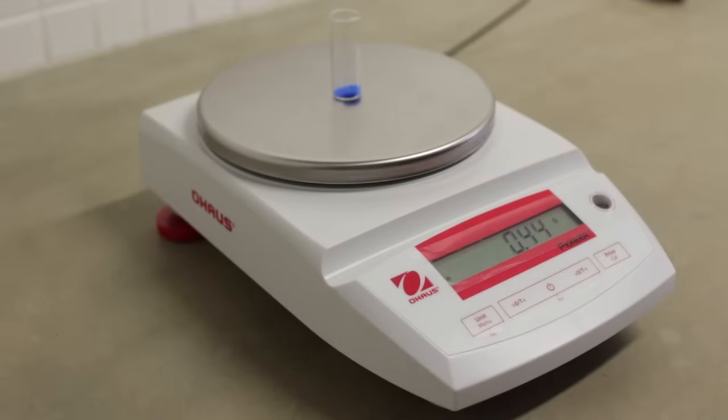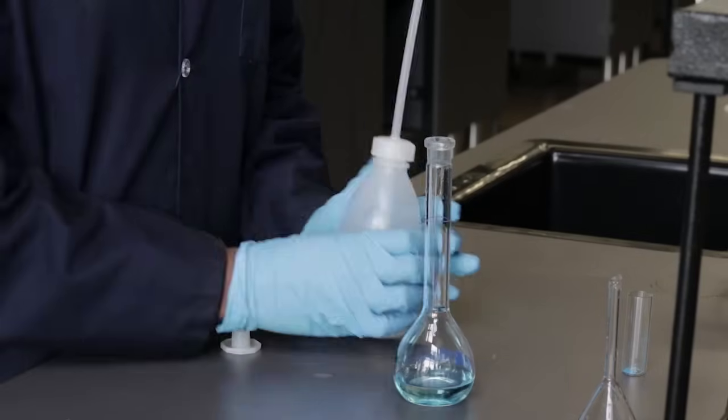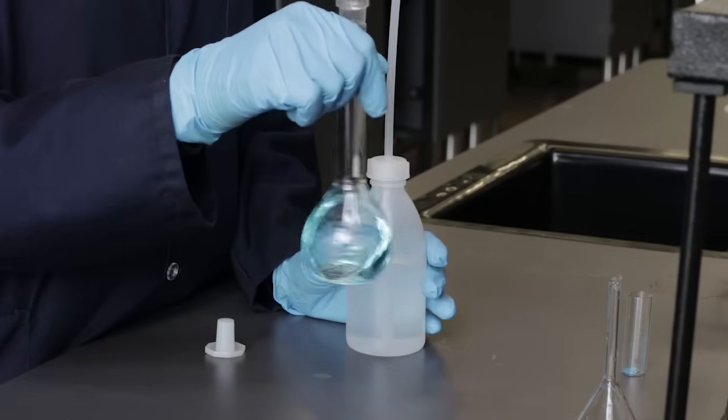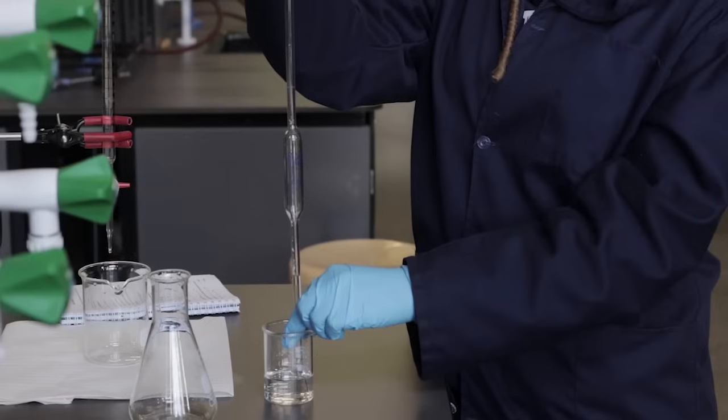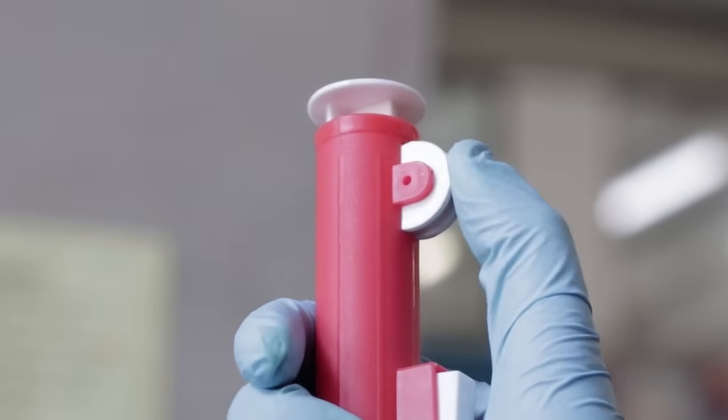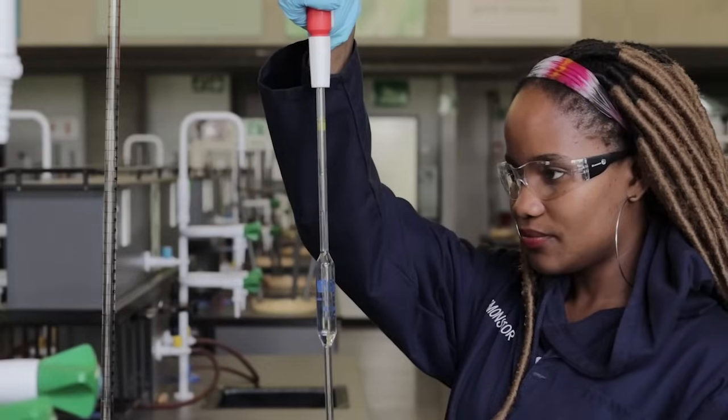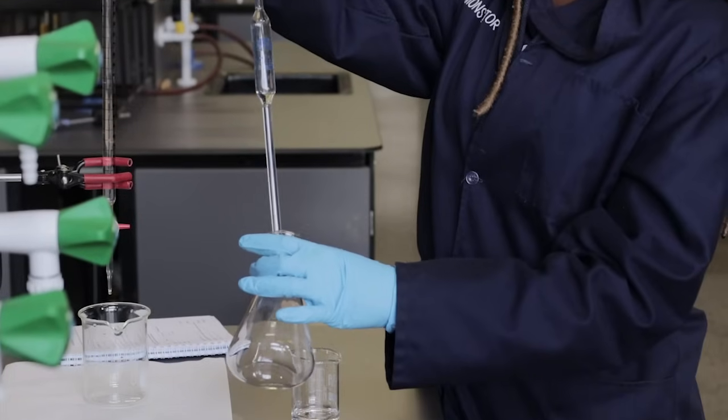Step 1. If the sample is a solid, it is weighed and then dissolved to make up a known volume of solution in a volumetric flask. Step 2. A pipette is used to measure accurately a volume of the solution, for example, 10.00 milliliters. This is emptied into a conical flask.